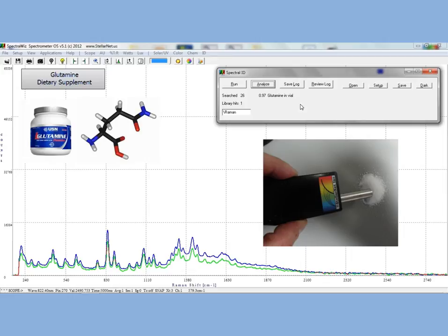When you overlay the library spectrum with the experimental spectrum, you can see that there is a slight difference. However, the spectral ID function matches it correctly.